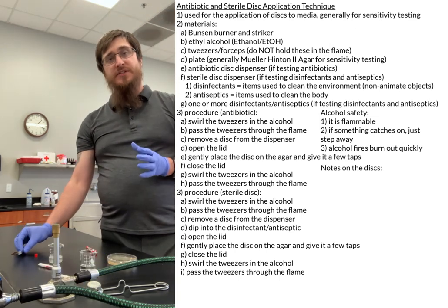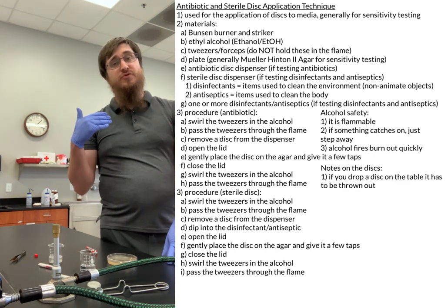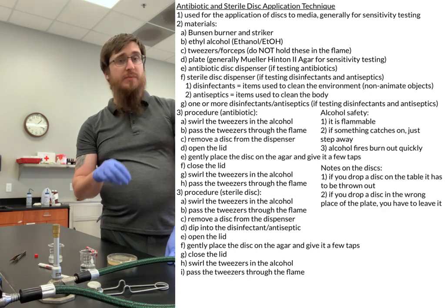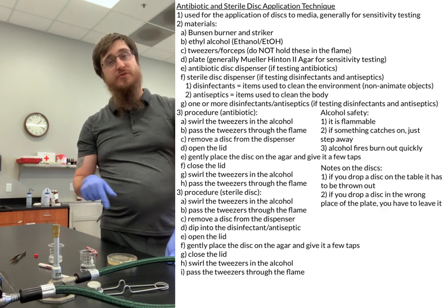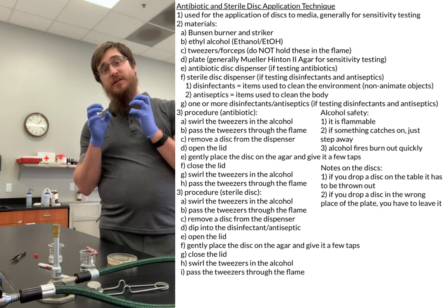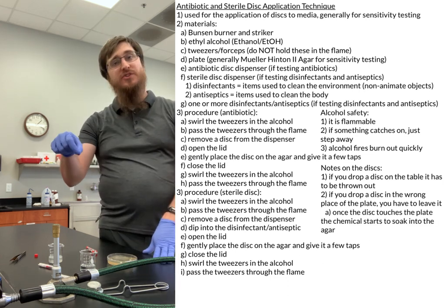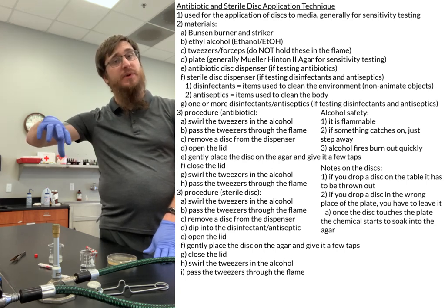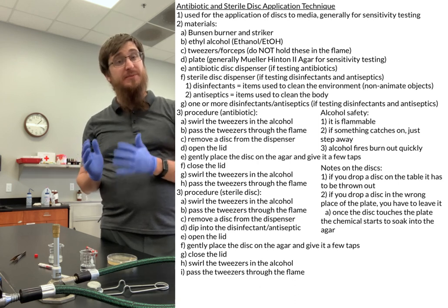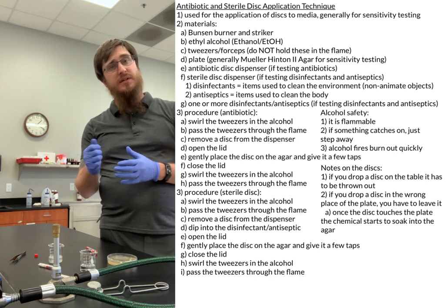Now a couple notes on the discs, since this procedure can be a little bit finicky with getting those discs out. If you happen to drop a disc on the table, normally we just have to trash it. And if for some reason you drop a disc onto your plate where it is not supposed to go, you can't really remove it. The big thing here is that the antibiotic or whatever disinfectant or antiseptic we're using, the second it touches the plate, it soaks into it quite a bit. Because of that, wherever it lands, we just have to leave it. So even if it's not in the best spot, you just have to leave it in that area, and then you may have to redo some of your tags on the bottom of it.